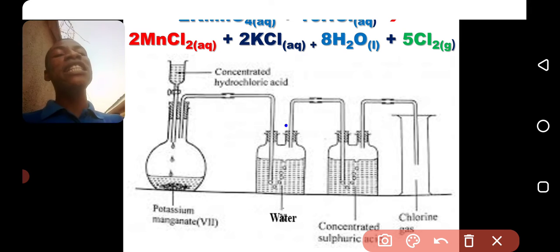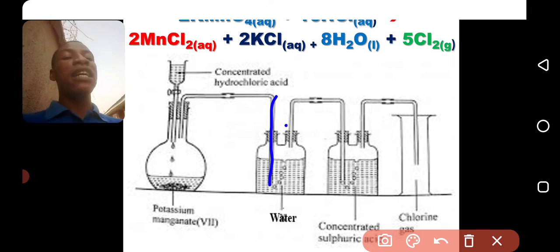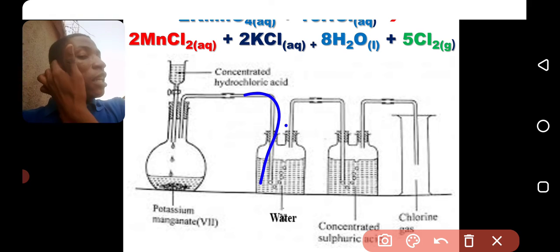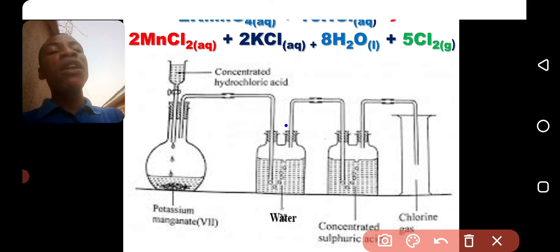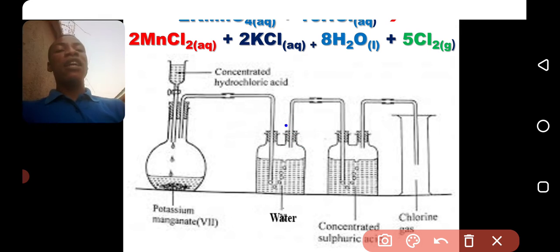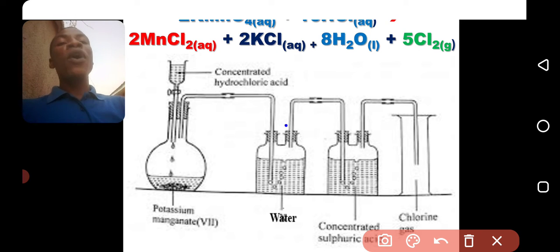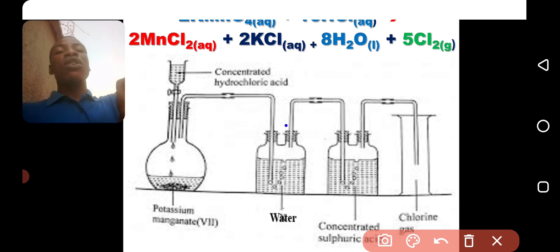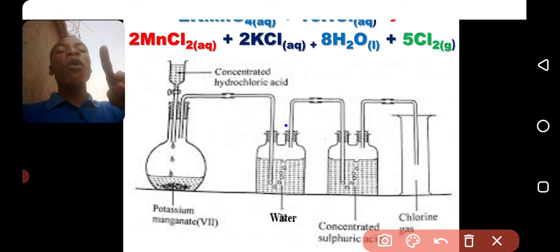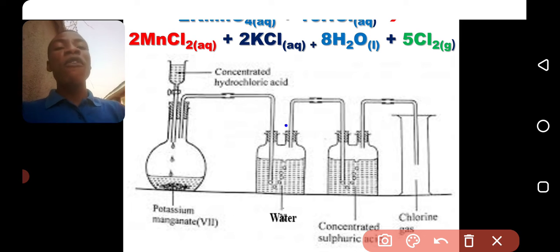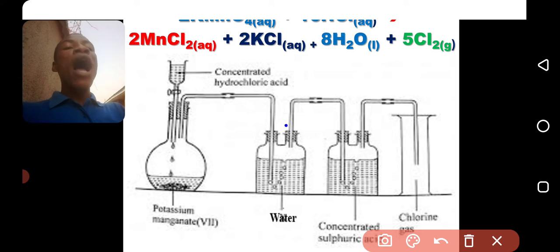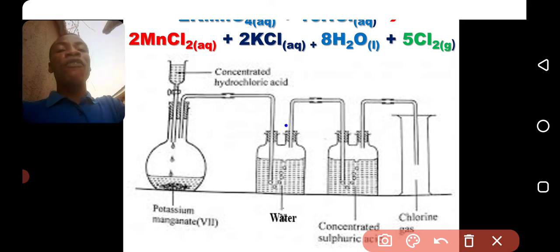Note that the first delivery tube is longer because we are using it to deliver gases into the water. The second tube is shorter because we are using it to take gases away from the bottle. So when delivering a gas into a bottle, make the delivery tube long; when taking gases away from a bottle, it is short — as you can see in this setup.